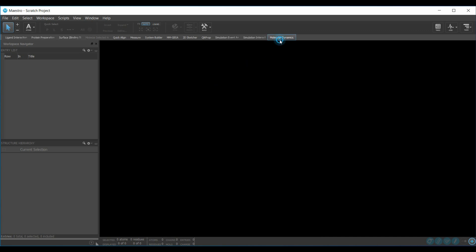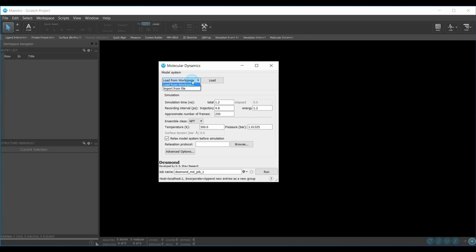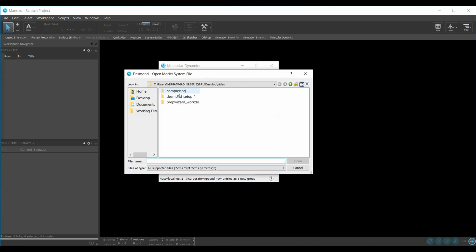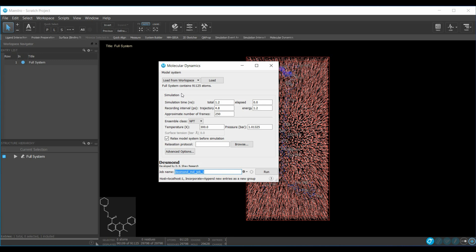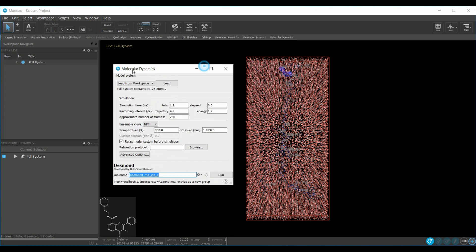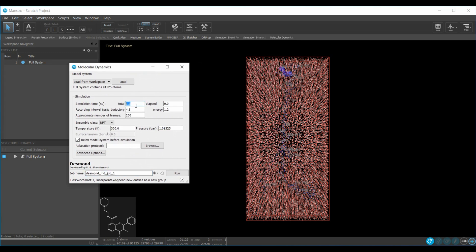Go to the Molecular Dynamics simulation tab. Import from file, browse to your complex, open the same project, and navigate to the last file and open it. Once loaded, enter the simulation time in nanoseconds, then set the trajectory interval and the number of frames. You can also customize the ensemble, temperature, or pressure. After setting all parameters, click Run and the simulation will start.